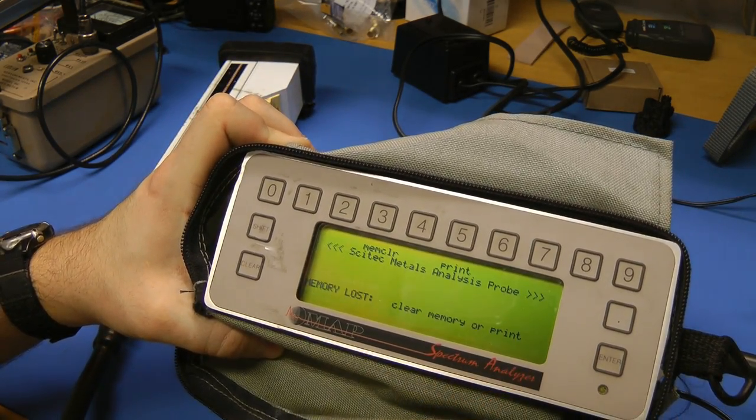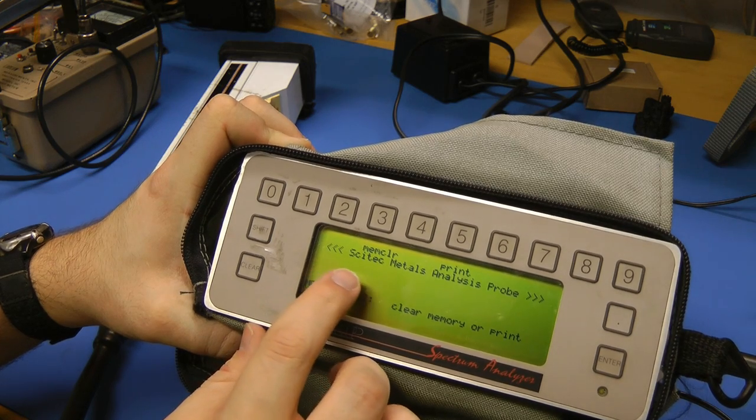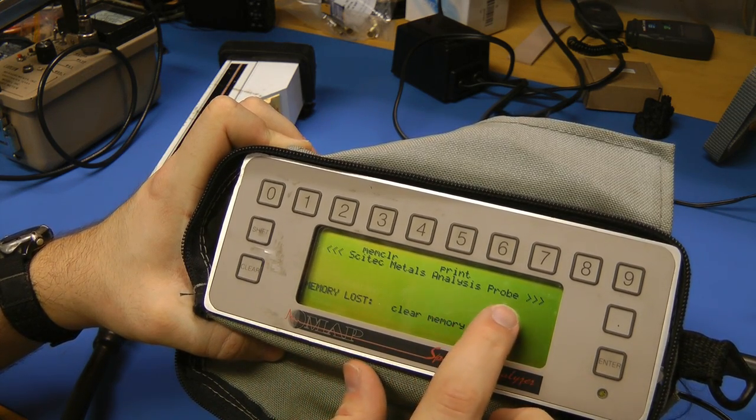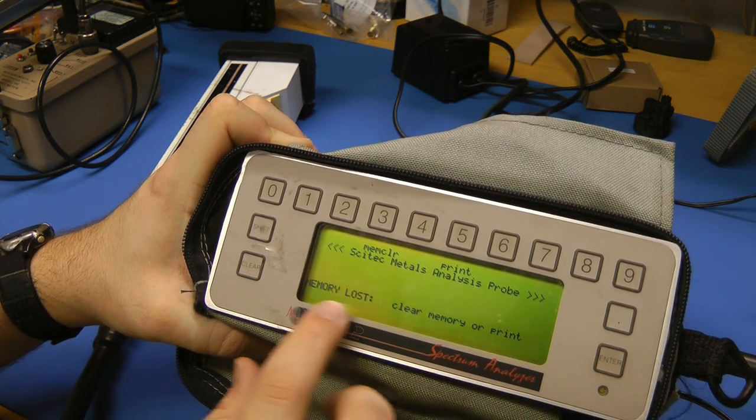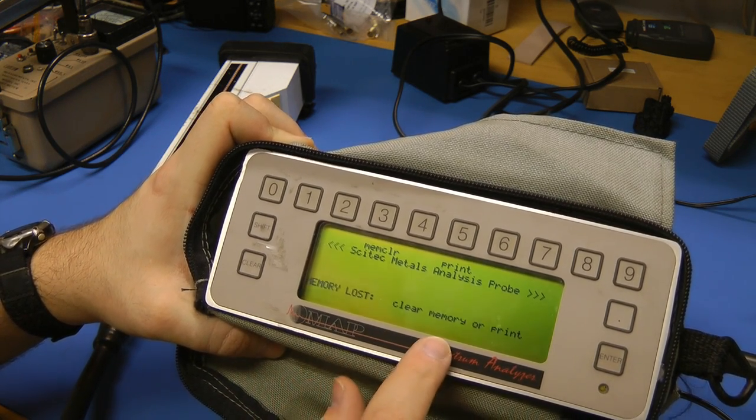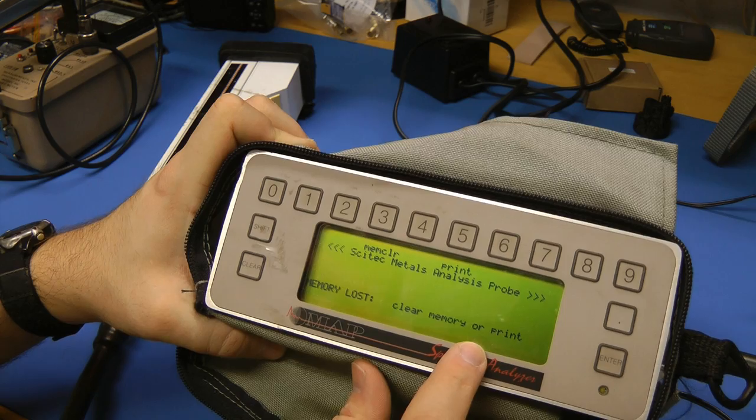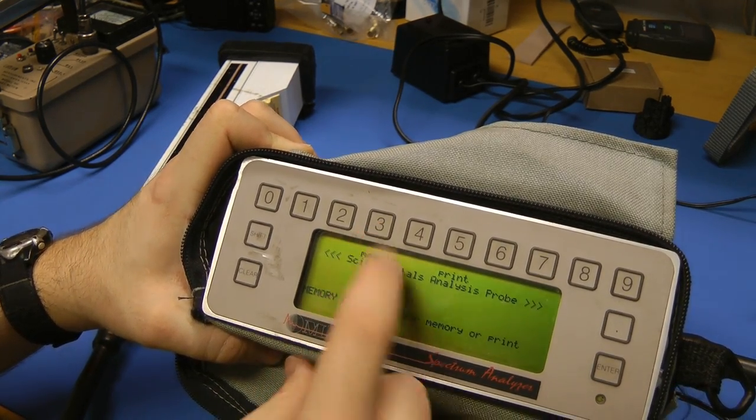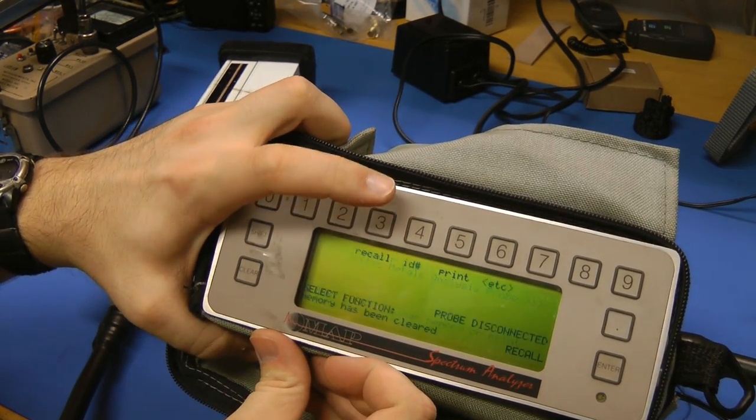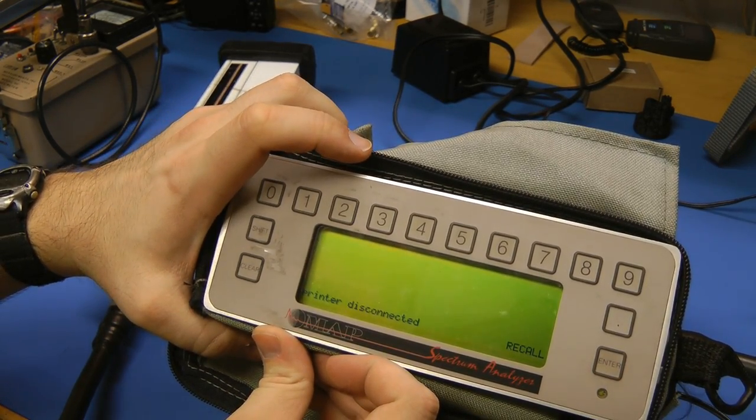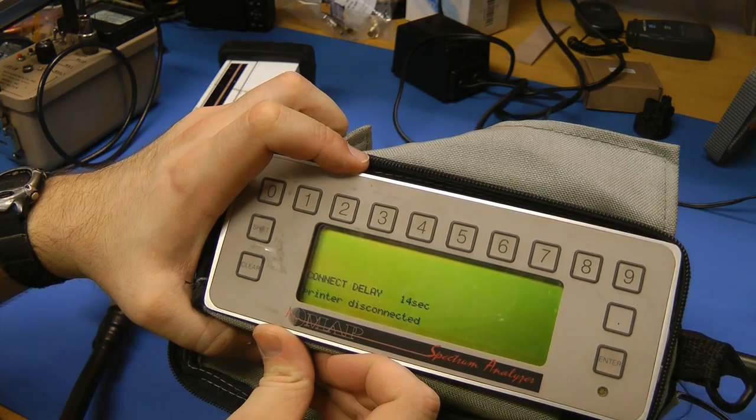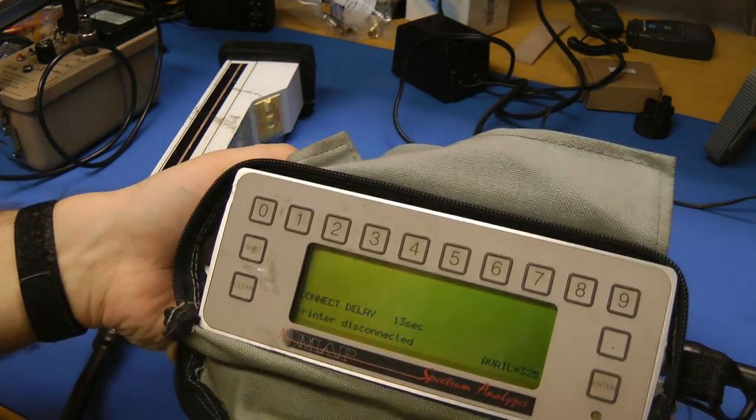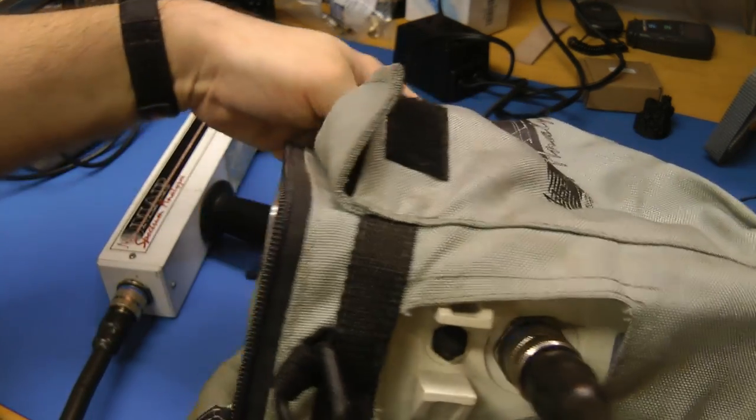SciTech materials, metals analysis probe. Memory loss, clear memory or print. Mem clear. Printer disconnected. So apparently you can connect a printer to this thing somewhere. I'm actually wondering where that is. That's probably somewhere on the inside of this fabric case thing.